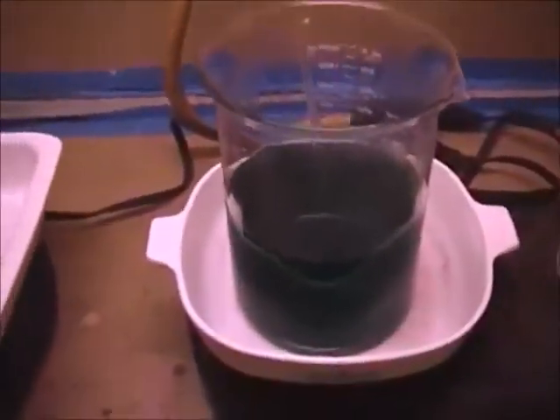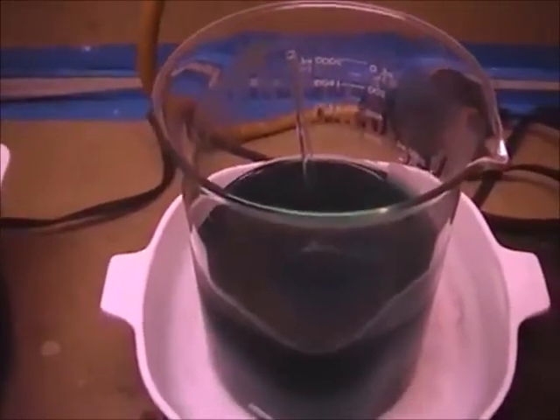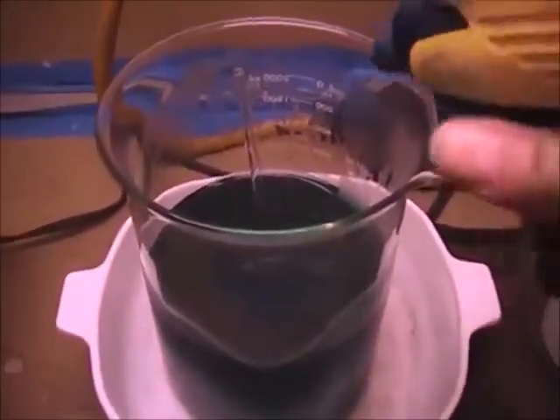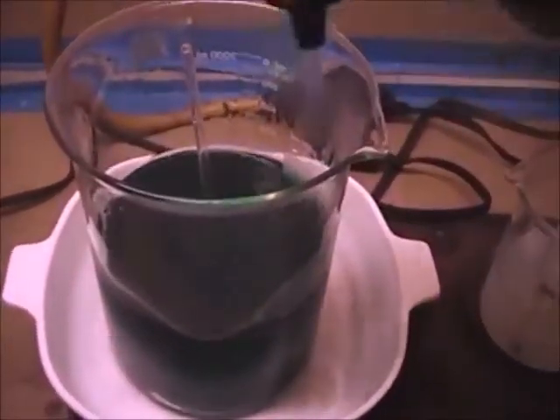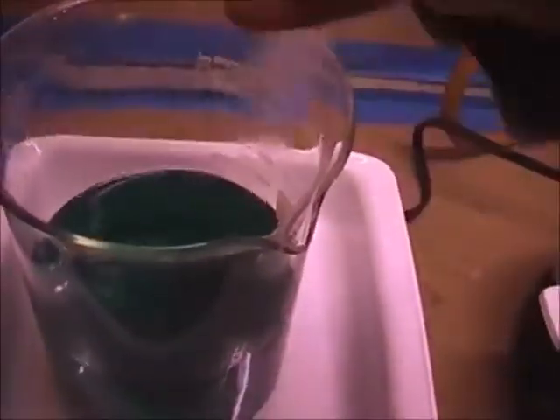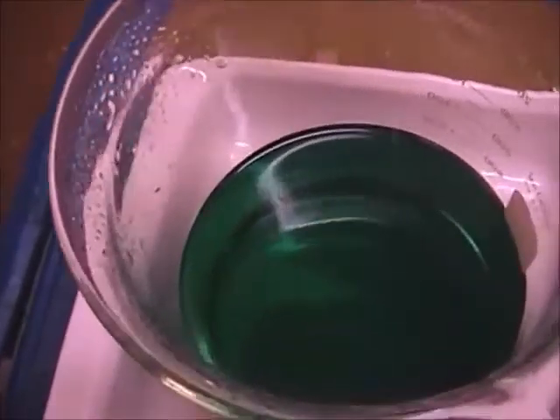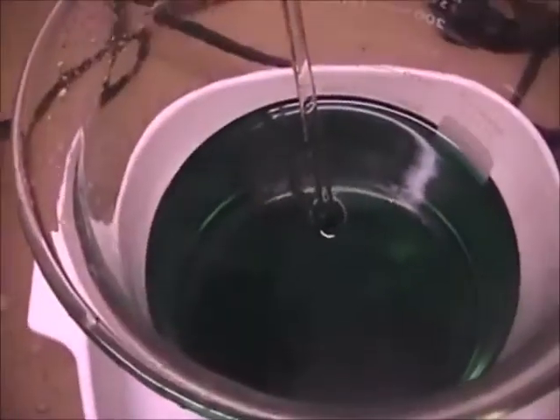So, how much sodium formate do we need? Well, we don't exactly know that. What we're going to do is add sodium formate solution to it, and we're going to check it after we think we've added enough. Work the sides of these beakers down here. Always use distilled water, remember. Let's see the clarity. You can see the clarity of the solution.